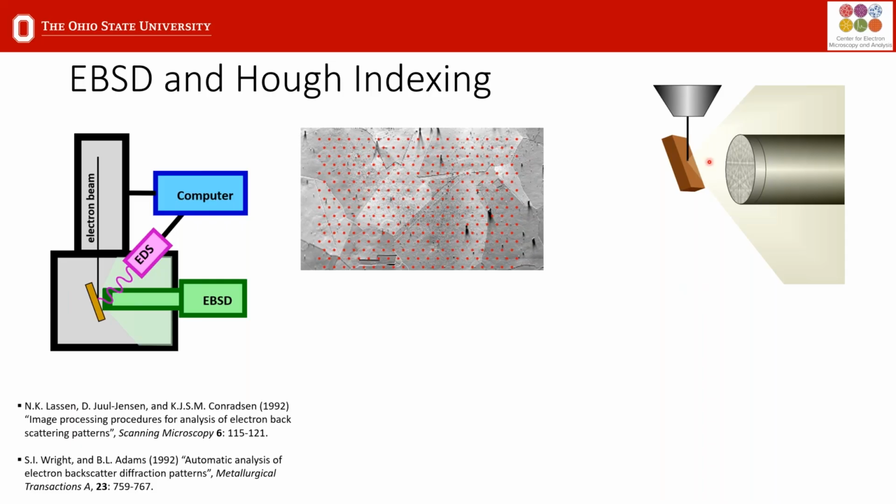Also, very interestingly, the beam will penetrate a little bit deeper into the sample, and at 45 or at 52 at least, you get band inversion. The bands that form at the bottom are a little bit darker than the bands on top, and if you do spherical re-indexing, that can make it quite challenging.